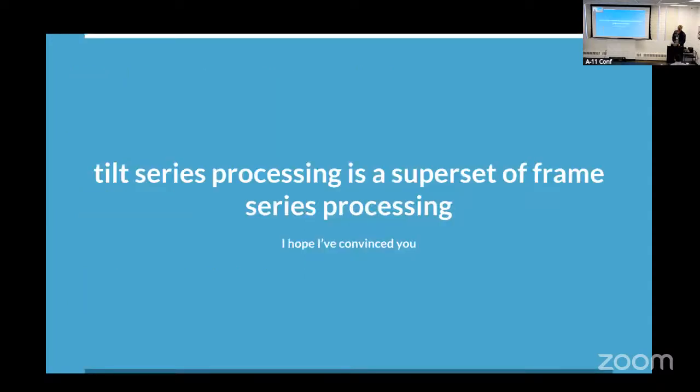Okay, so I hope I've convinced you of this little thing, that tilt series processing and frame series processing are basically the same thing, not that difficult. I really like this quote: there's a lot of value to be created in uncomplicating things that people have been complicating. Tomography is not that difficult or not that hard. There's a lot of history and a lot of people using existing software packages that weren't designed to do things. And that is what is making your life more difficult if you're trying to be a tomography practitioner these days. But hopefully it will all get easier over time because it's already been solved for single particle.